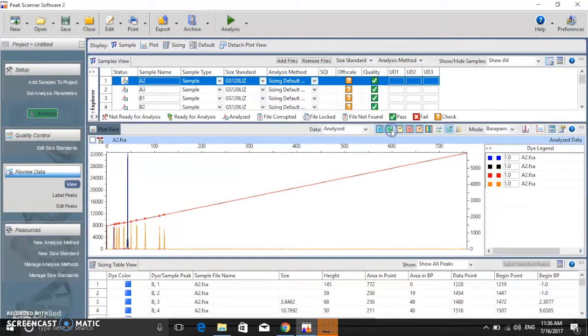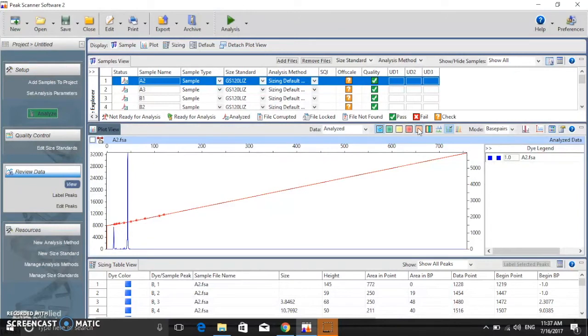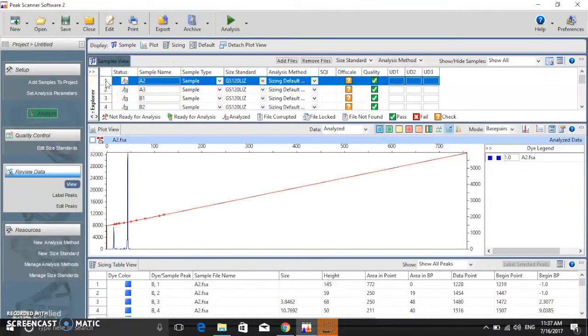In order to review more details of the results, you can deselect the dyes not used in the assay. You can further adjust views. First, select all samples by clicking Shift plus first row and Shift plus last row.